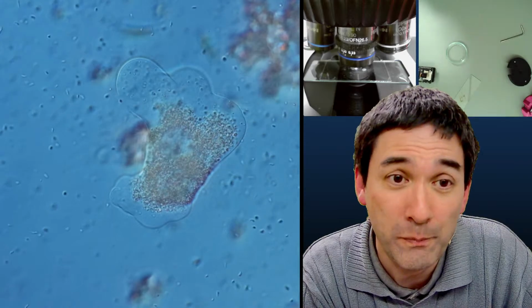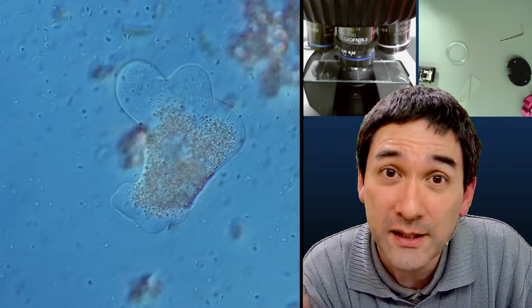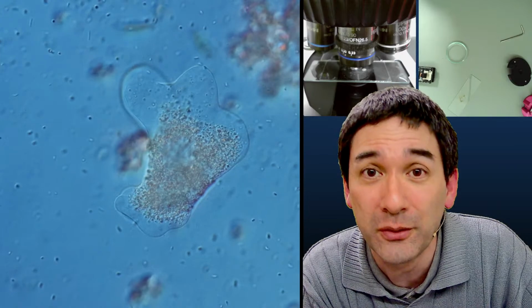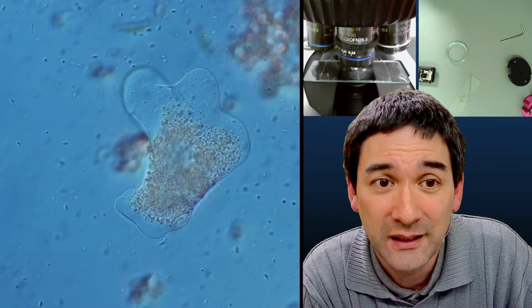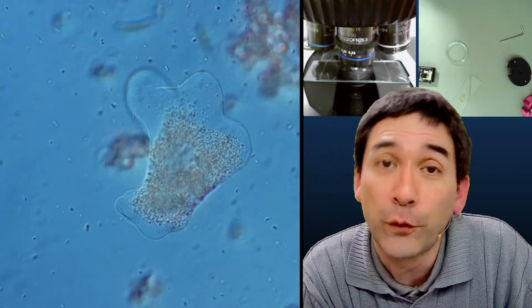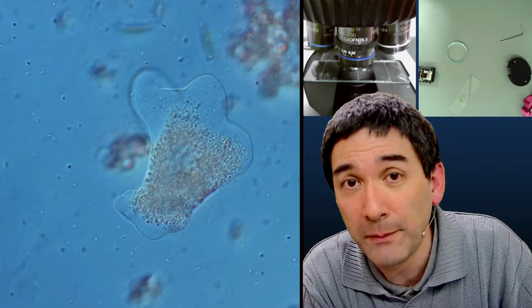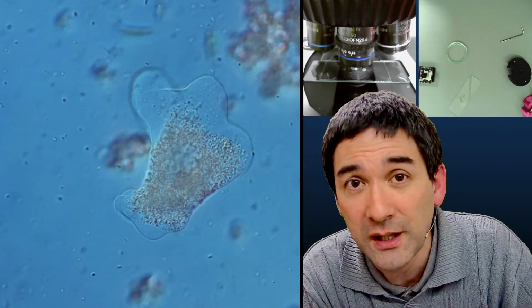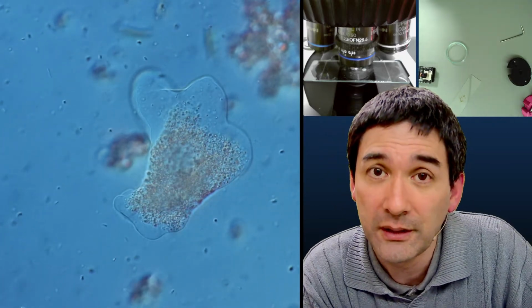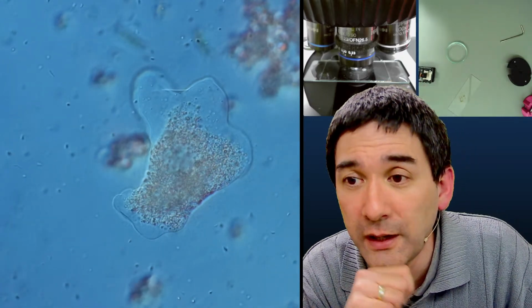If you compare the microscope objectives from different brands, you see the same types of objectives reappearing over and over again, because there seems to be a company in China that manufactures them for all different brands. However, the Big Four, the really expensive companies, have their own manufacturing. They do not fall back on those standard parts but make their own things, even if it's also made in China, in their own manufacturing facility there.